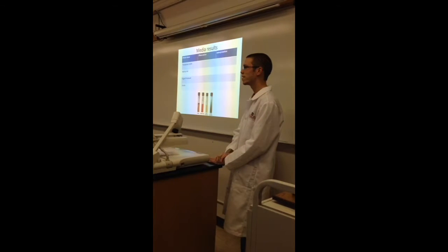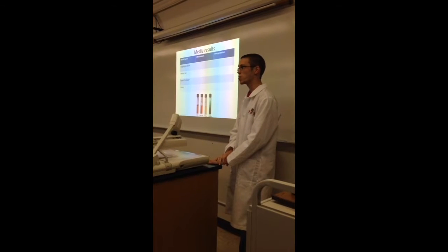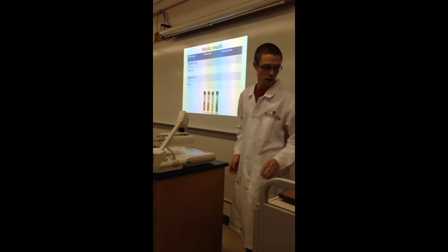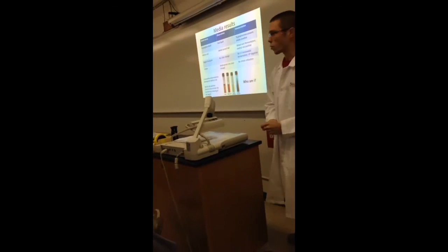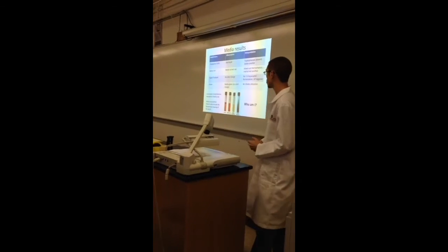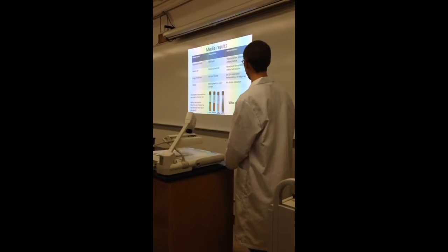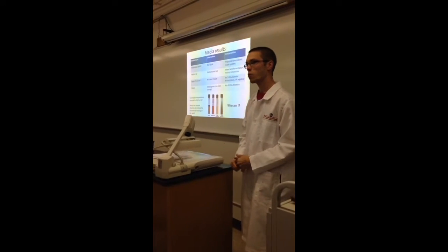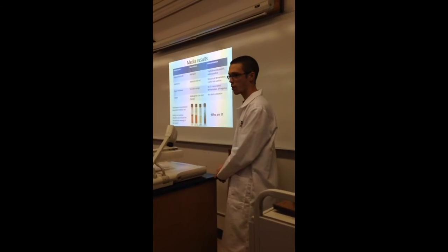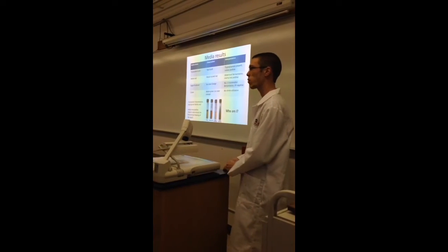What about citrate? Citrate utilization. It was negative for citrate, so you can just write citrate negative, or it does not utilize citrate. As I said, for methyl red positive, you do want to say that this is mixed acid fermentation. I'll accept methyl red positive, but only for partial credit. And the Vogts-Proskauer was 2,3-butanediol. This is another one where if you say VP positive or VP negative, that's only worth partial credit. You need to say what it actually is looking at. So what is the biochemical meaning of that result?